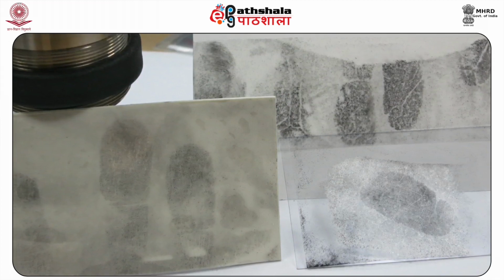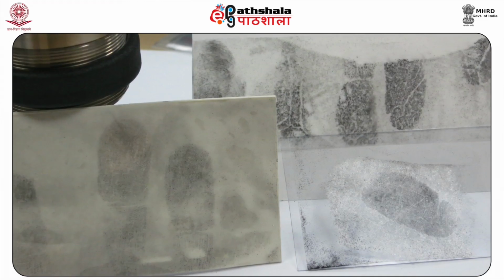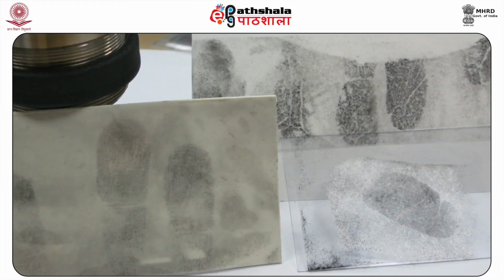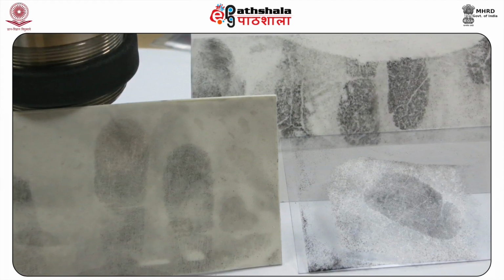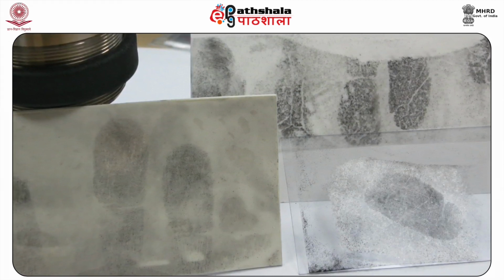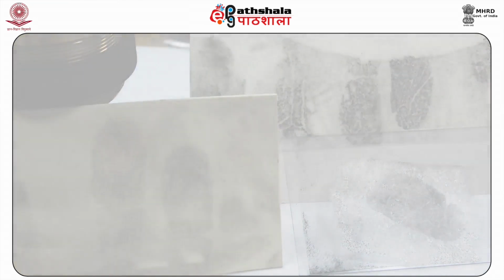Since these sebaceous components are not soluble in water, the physical developer latent print development technique is particularly useful on wet paper or paper that has previously been wet.